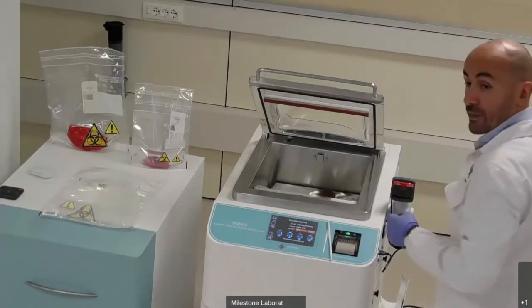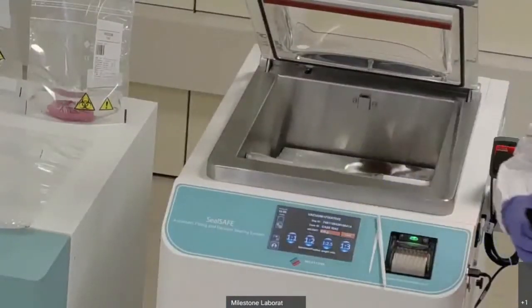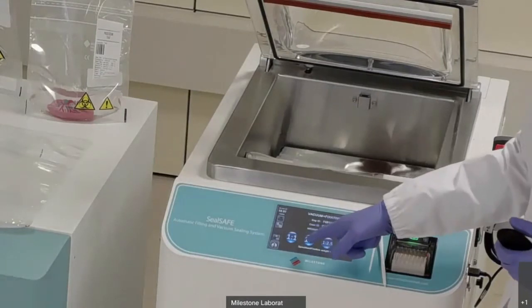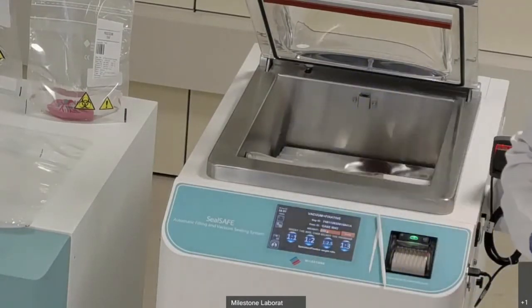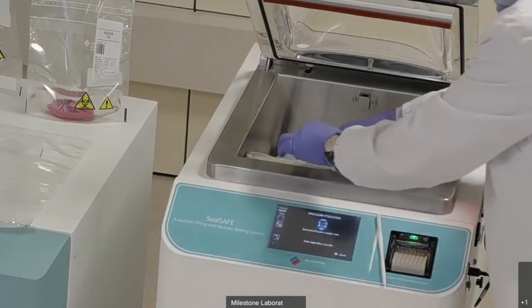And now I do have, instead of vacuum, the ratios on the display. What do they mean? Basically, I will select 1 to 2 for this demo. It means that for each gram of specimen, the system will dispense 2 grams of formalin. I will select 1 to 2, and I will arm the injection nozzle.